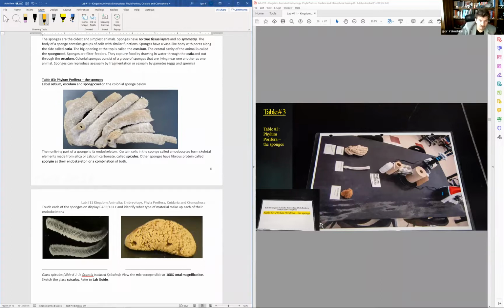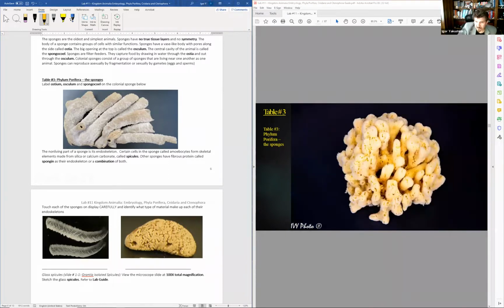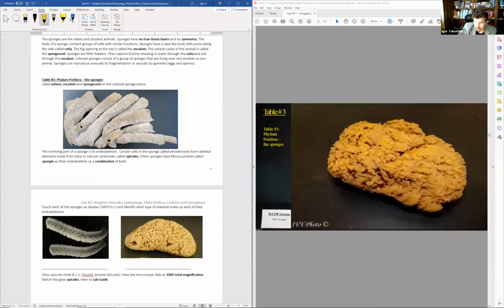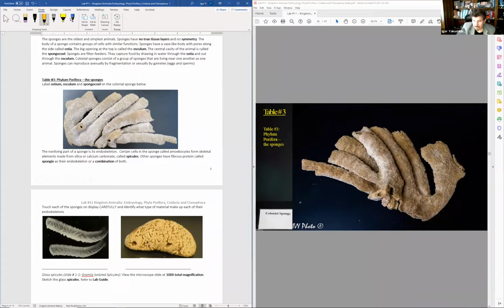So in this case, whenever you're looking at the sponge, you see the sponge known as a perforated sac has tons of tiny little bitty holes. Here we go. So tons of tiny little bitty holes. Those particular holes are known as the ostia. Ostium is one, a bunch of them are ostia.